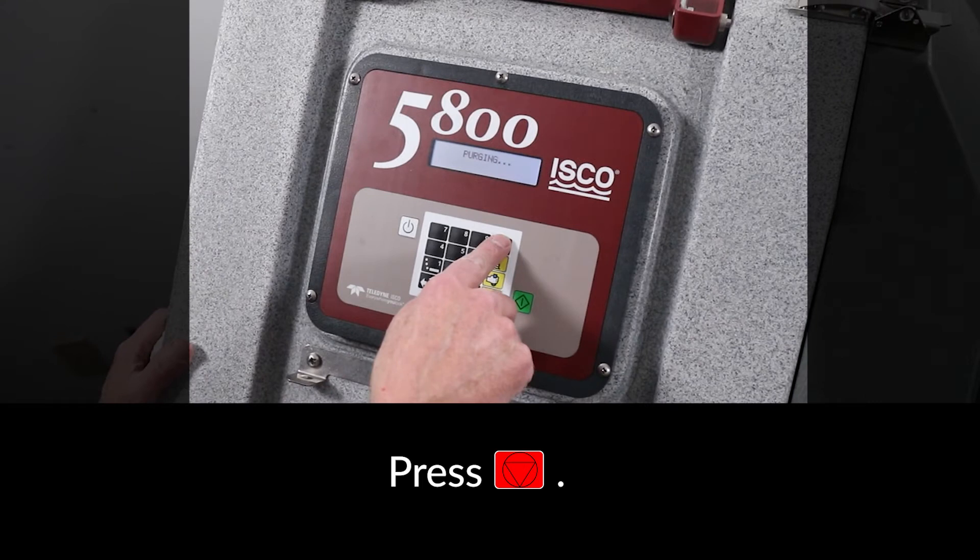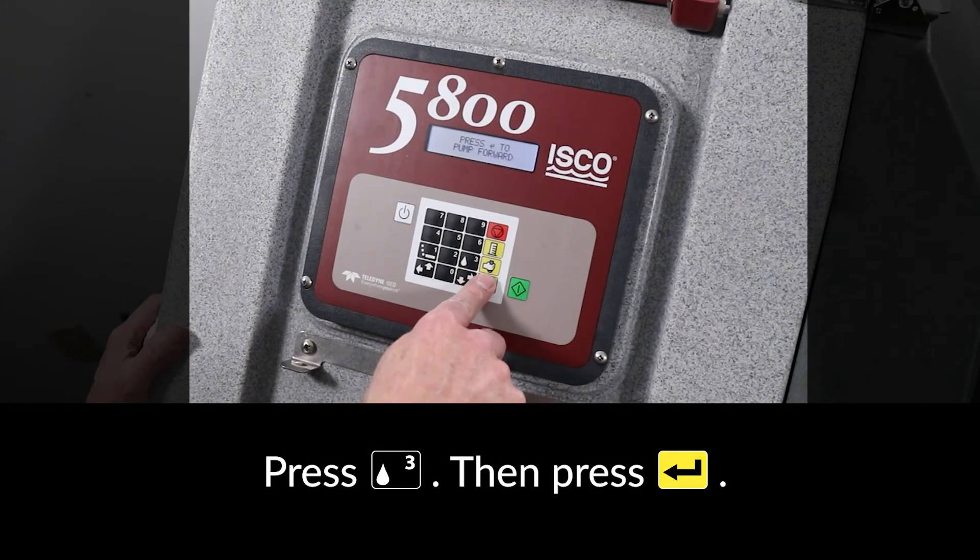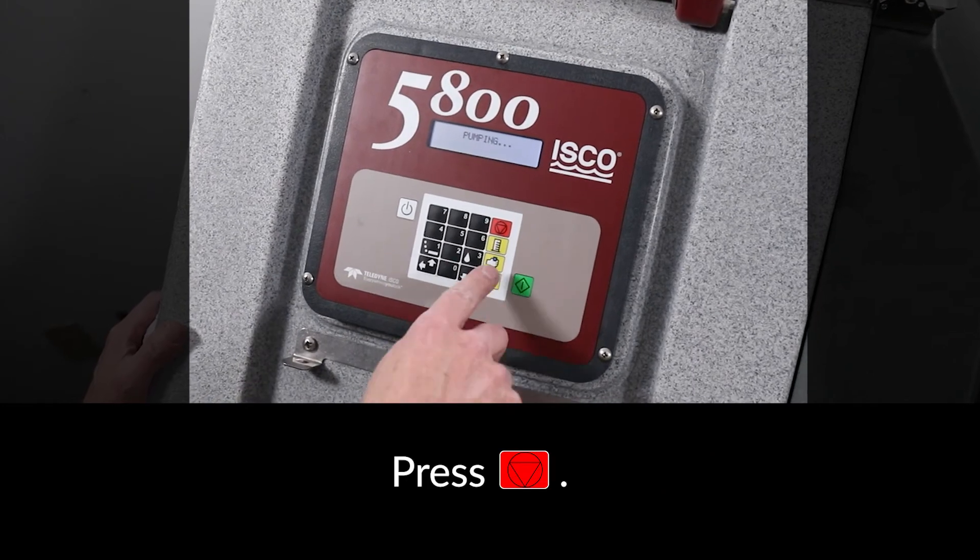Press the red STOP key. Test pump forward by pressing the 3 key followed by ENTER. Press the red STOP key.